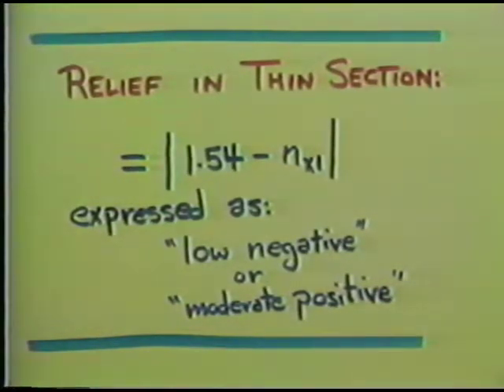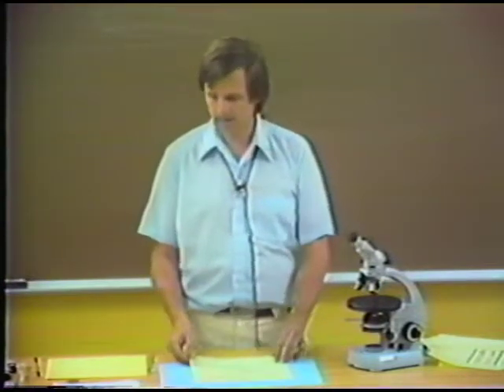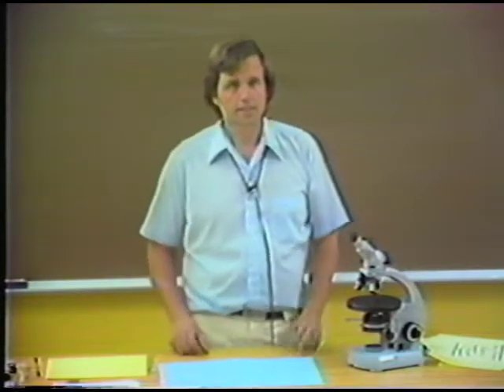Okay, now how do we determine if a mineral has positive or negative relief? We know something about how to estimate the degree of relief, but how do we determine the sign of relief? Well, there are two good methods, and I'm going to demonstrate these methods using some immersion mounts.